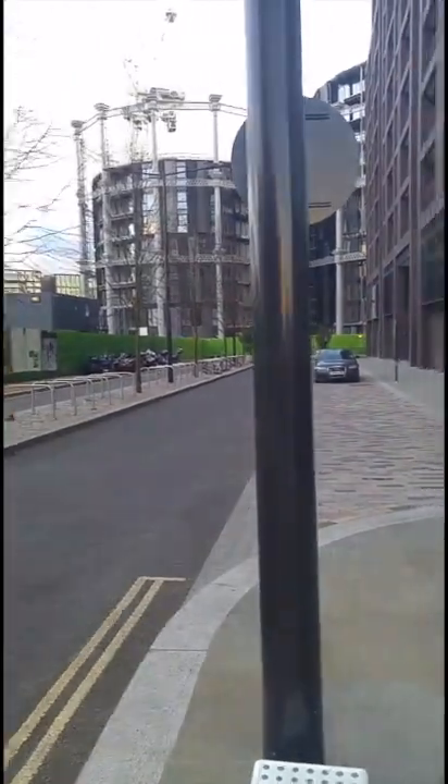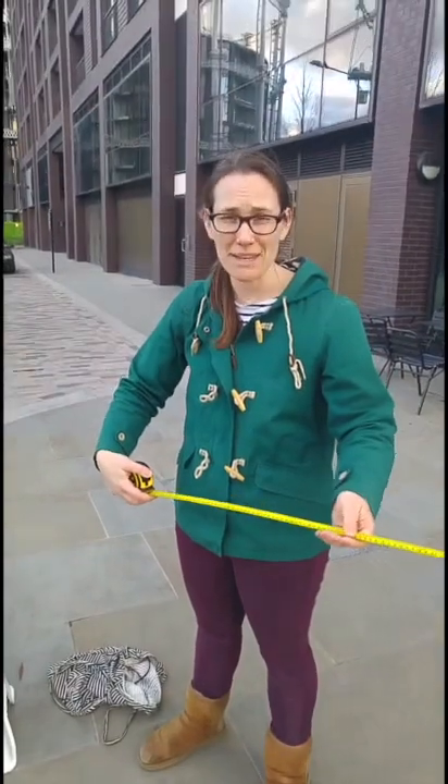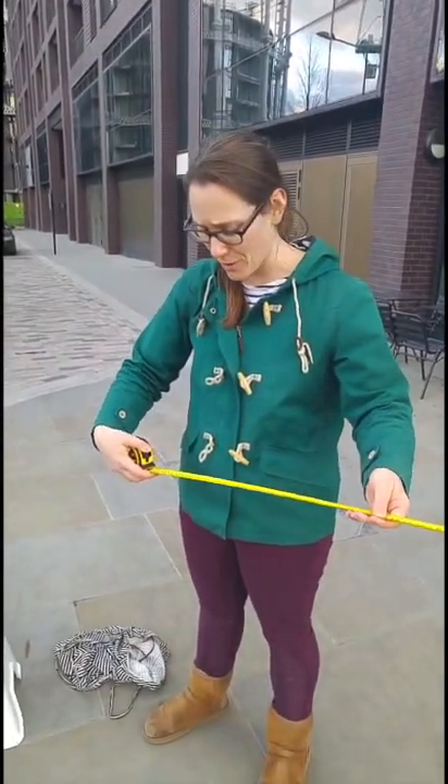My site for the diffusion tube is going to go on this lamppost here. The first thing I'm going to do is measure a minimum of 2 metres from the floor.